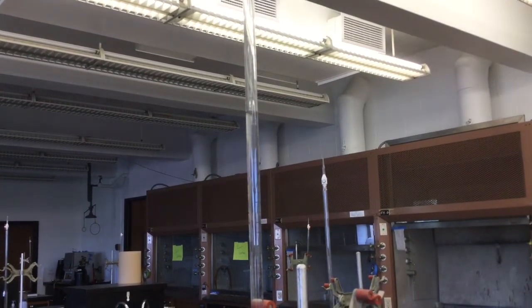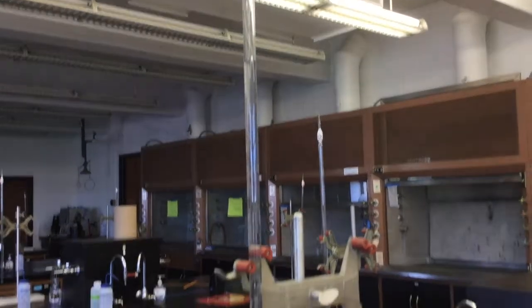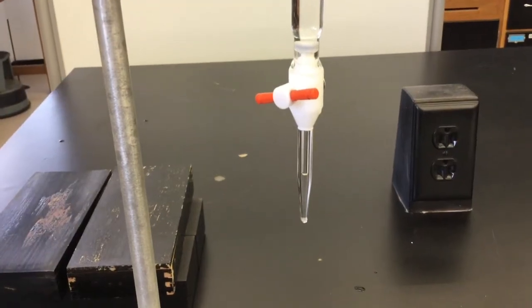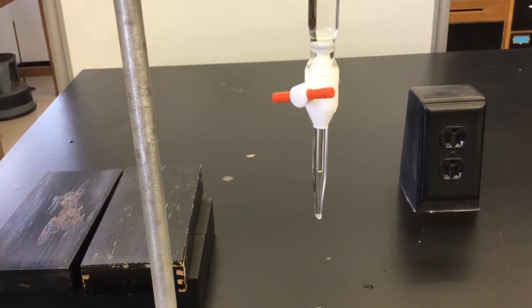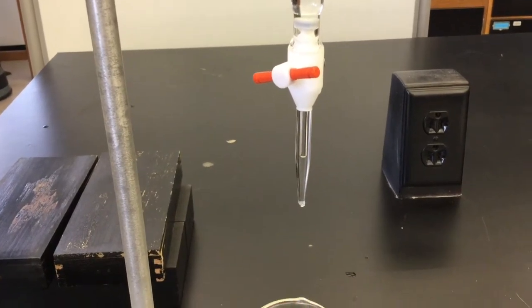Before you begin the titration, you're going to need to make sure there are no air bubbles. Check the burette itself and the bottom. Notice that there is an air bubble. The presence or absence of an air bubble can change the measurement that we have on our burette.